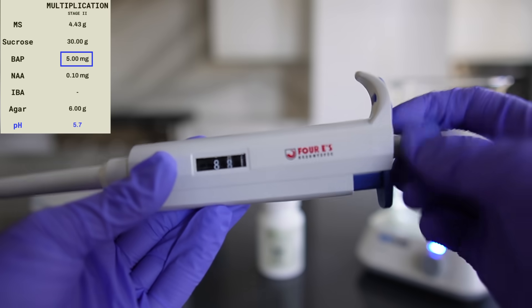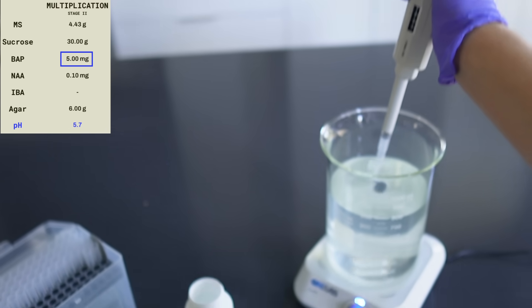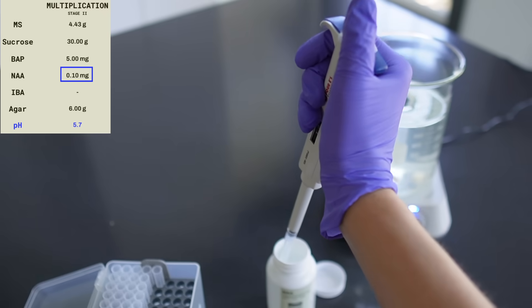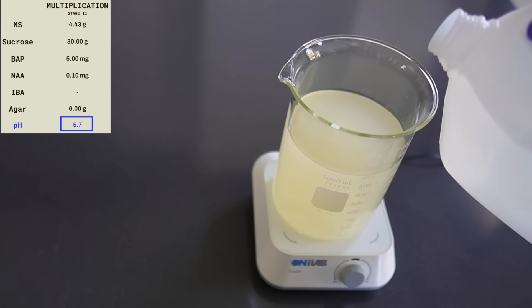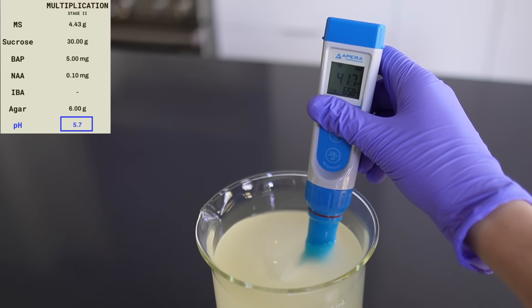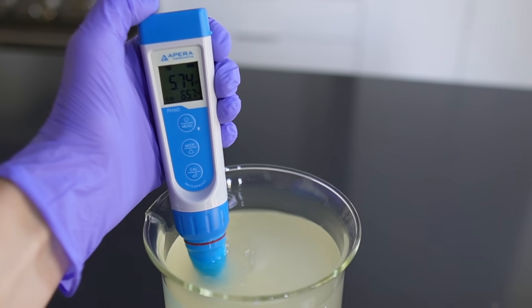Using a pipette, I add 5 milliliters of the BAP solution, 1 milliliter at a time. After that, I add 0.1 milliliters of NAA following the protocol. The solutions are a concentration of 1 milligram per milliliter, so if the protocol says we need 5 milligrams of BAP, you know to just use 5 milliliters of the solution. The last ingredient is 6 grams of agar. After all ingredients are added, we top off the water to the one liter mark. Then, using a pH probe and pH up and down, I adjust the pH to 5.7 — pH controls how the plants are able to absorb nutrients.